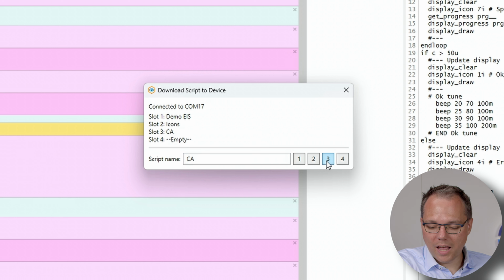But let's say I just am not capable of inserting my electrode or cell correctly. And now we should get like a current that is lower than the 50 microampere, and we got a negative result. So these are the different ways to put a script behind the buttons of your EmStat4T.